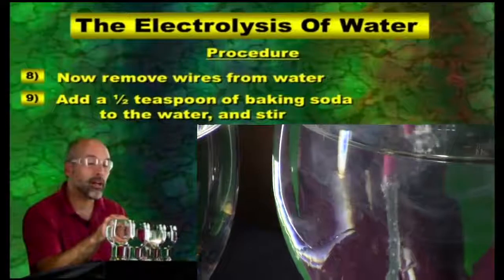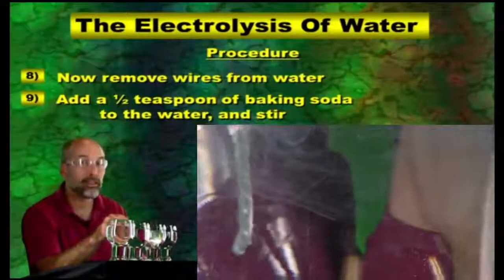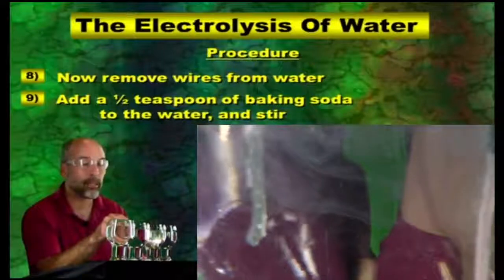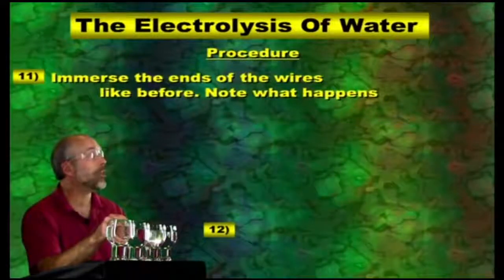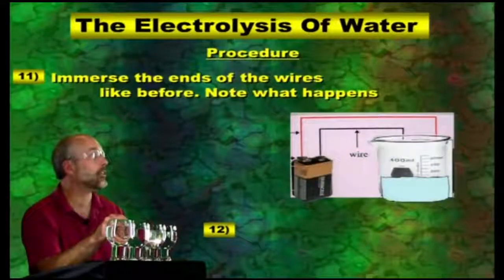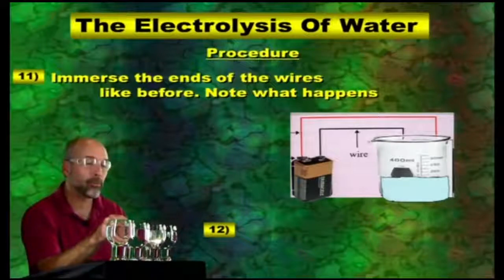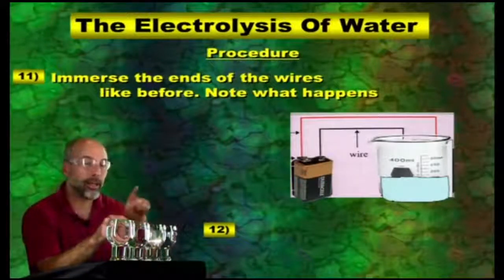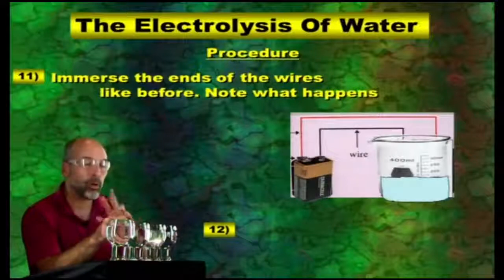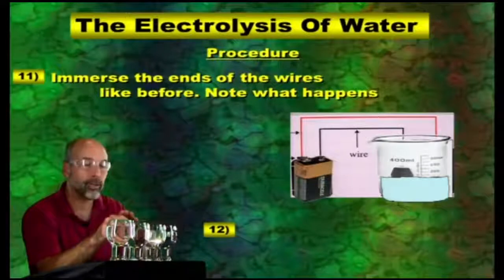Now that we have a color change starting to happen here, as well as bubbles, we have two things on the side of chemistry really taking place here. We keep that in mind and say, okay, something is happening. Write down your observations as this is taking place. What else might be going on here that would indicate a chemical change? Well, if we have a closed circuit, where electrons are flowing from the negative terminal to the positive, we may actually generate some heat in the battery.